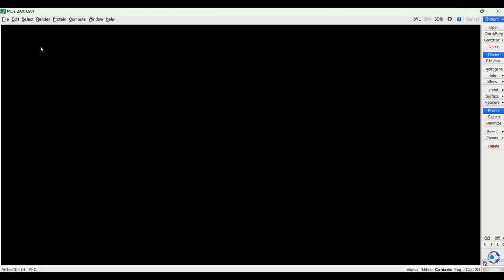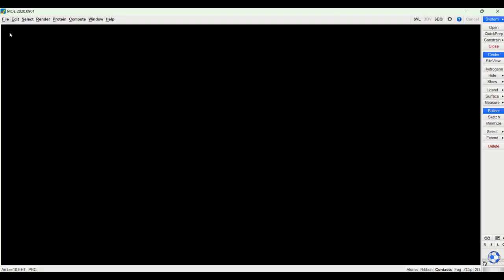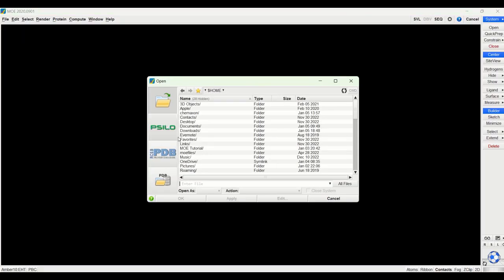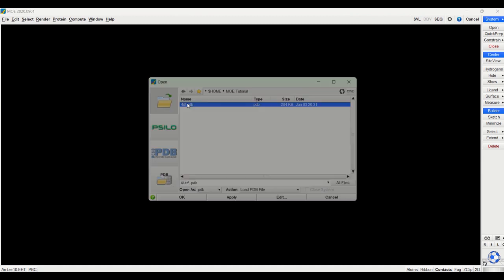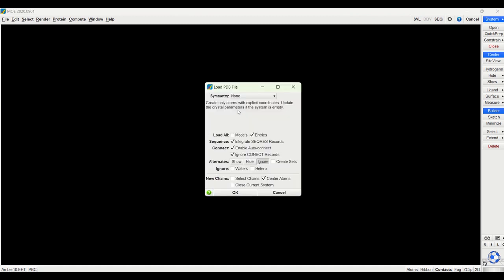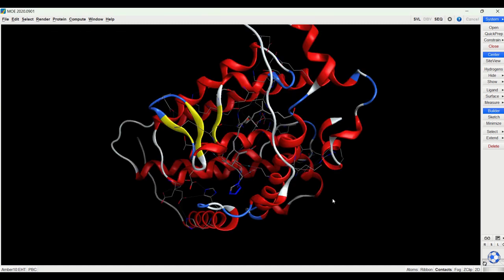Now back in MOE we can open the protein by going to file open, then going to where the protein is saved. All this can stay checked as is. And here's the protein we downloaded.